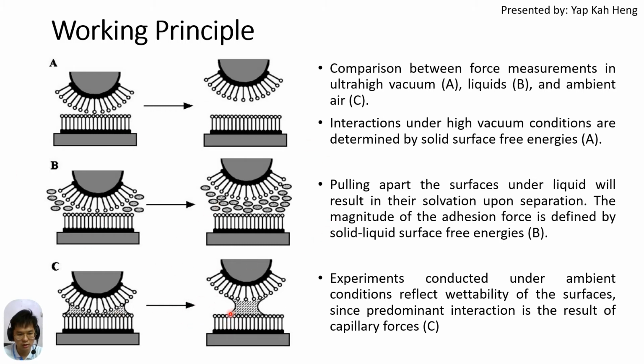We can see that the water molecule sticks to the tip and also the sample, but figure B doesn't have that. So the experiment conducted under the ambient condition reflects the wettability of the surface, since the probe-sample interaction is the result of capillary forces. So first we have to understand what capillary forces are.